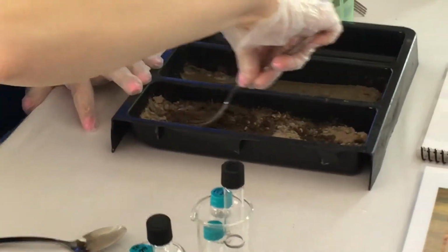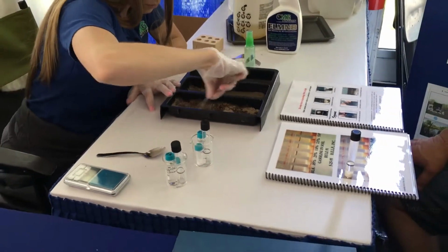Spread it around to make sure that soil sample is completely saturated by that diesel, get it nice and contaminated.